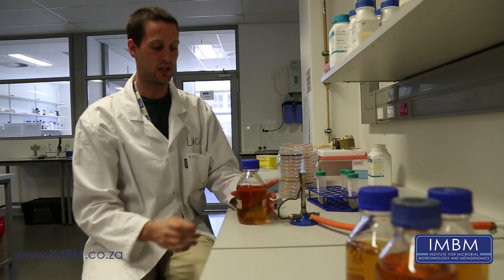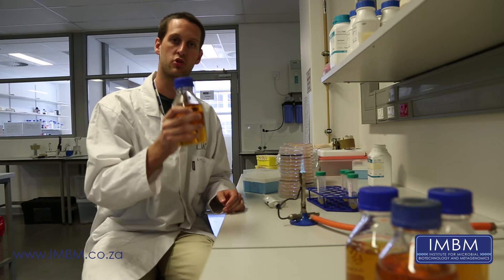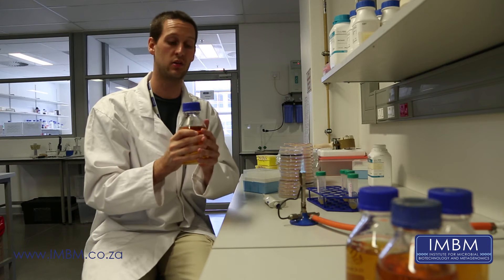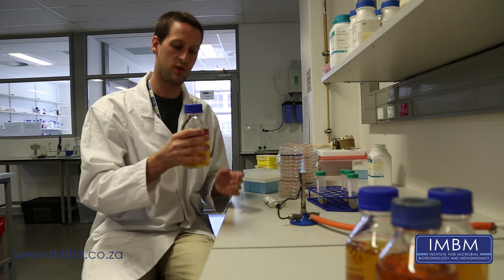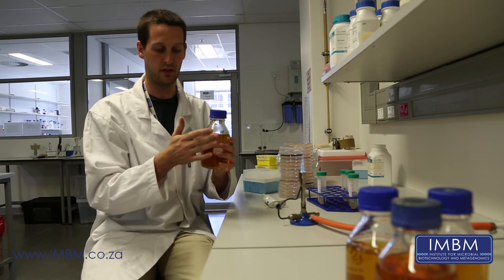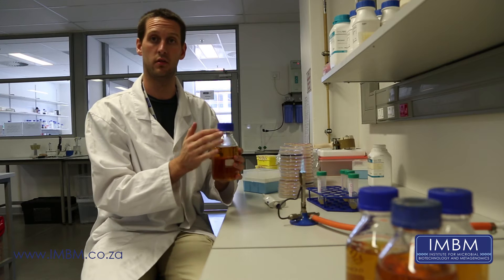We are going to start the antibiotic overlay and the first thing to do is check the temperature of your agar. We have had this sat in a 55 degree water bath so it's cooled down to a reasonable temperature. If you don't have access to a water bath, just make sure you can hold the molten agar in your hand comfortably without hurting yourself. Try not to let the agar go below 30 or 40 degrees — that's about when it will set.